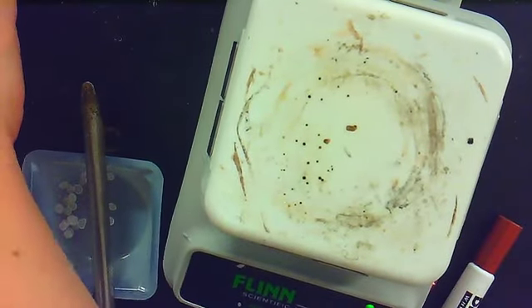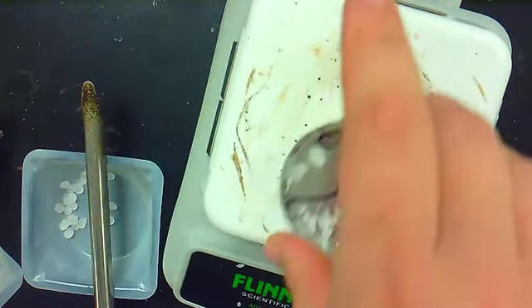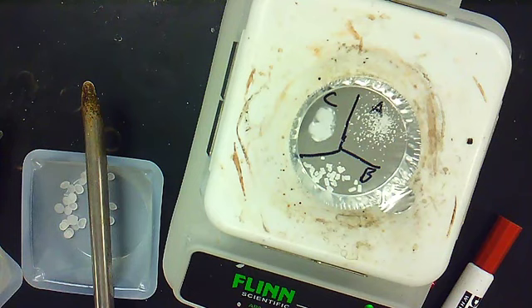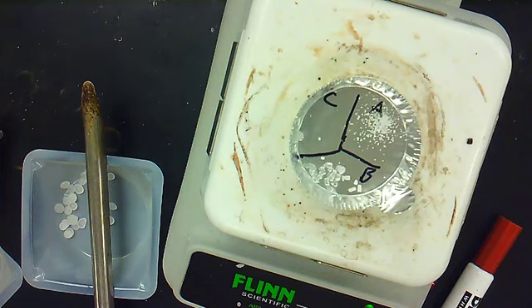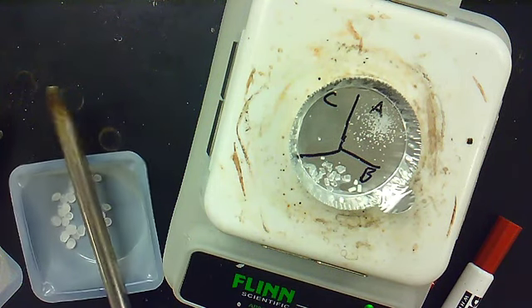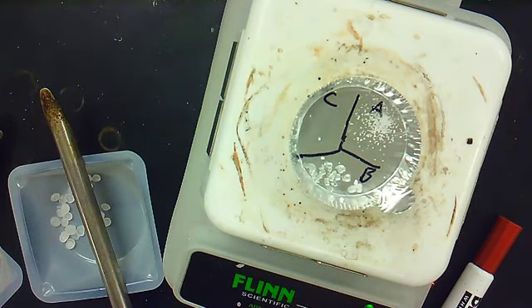Okay, it's already been heated. So let's watch them melt. Okay? So what do you see happening? Hopefully that contamination, there is a little bit of contamination I see, but hopefully that won't affect it too badly. Sometimes that happens.